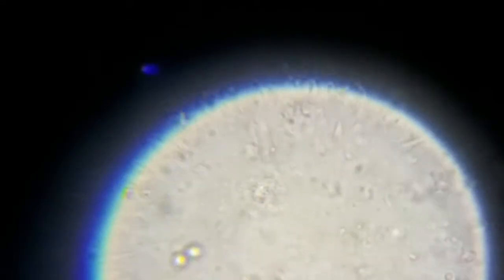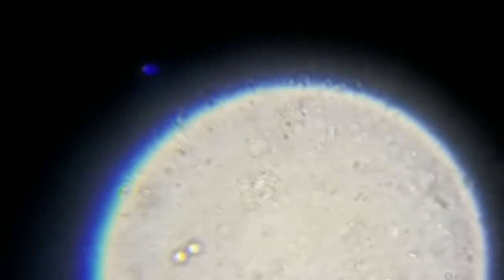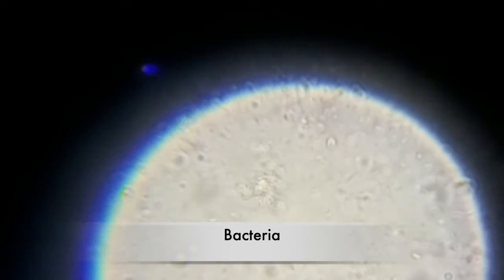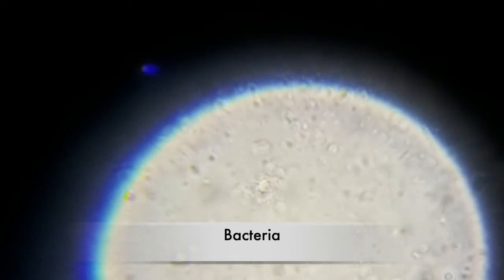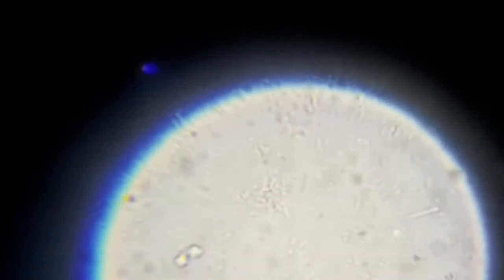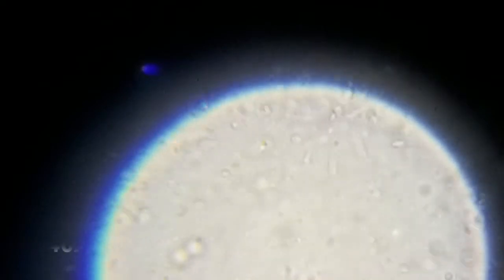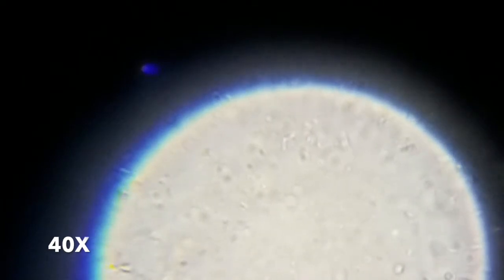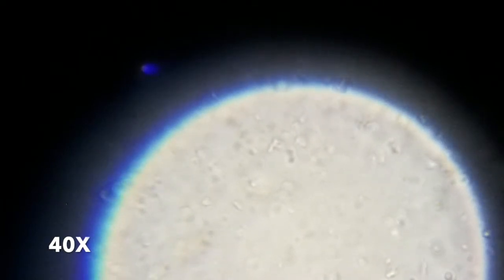These stick things and circular things you see moving back and forth are bacteria. Bacteria and viruses are different. Bacteria are living, but viruses are not living. I cannot see any viruses with this microscope, because this one only has 4 times, 10 times, and 40 times magnification.